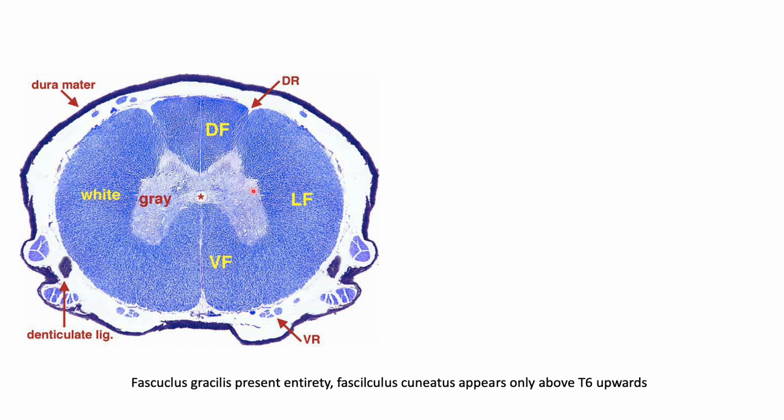In this very nice stain, the spinal cord, which is also made up of several neurons or nerve cells, and especially the fibers or axons of the nerve cells, will be concentrated within the spinal cord. The area colored blue is the white matter, and then the area within this H-shaped structure is the gray matter.